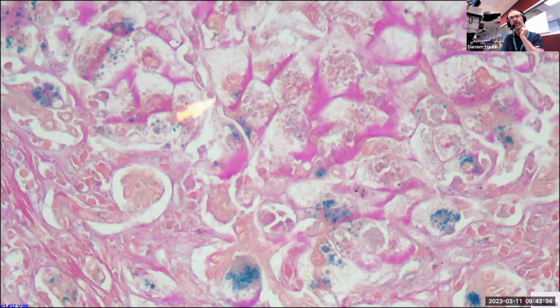I can't imagine that any of that would have interfered with then subsequently going in with your reagents, your hydrochloric acid and your potassium ferrocyanide. I don't think that would have interfered with it, but I've not tried it, so I'll check with Chris. Equally, if you'd done this the other way around, what would be the risk?